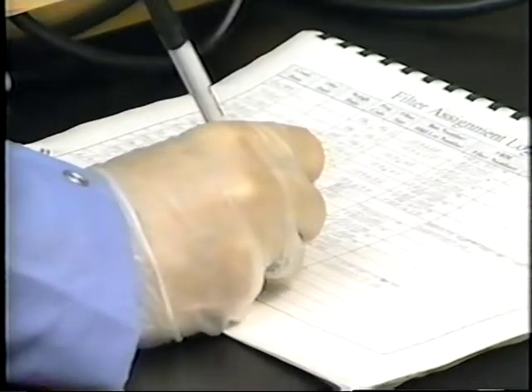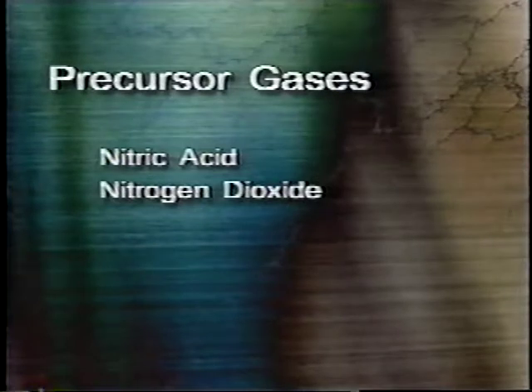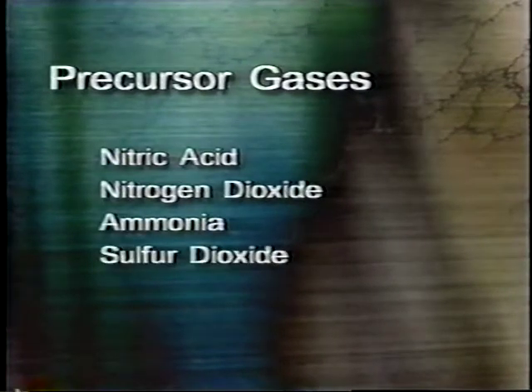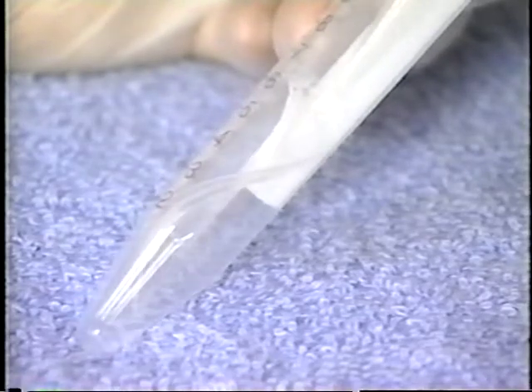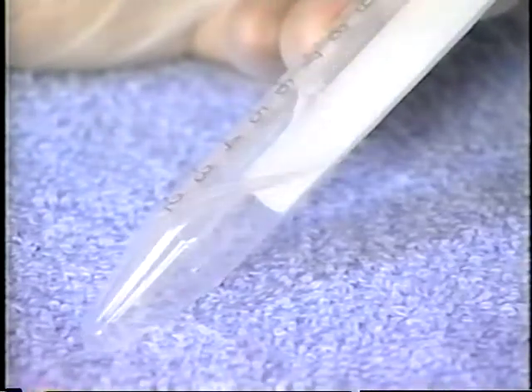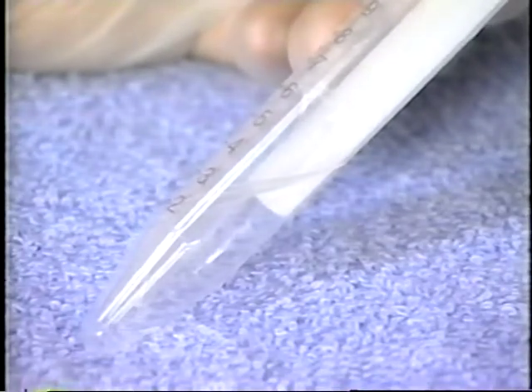and filter ID numbers. In areas with large secondary inorganic aerosol contributions to PM2.5, precursor gases such as nitric acid, nitrogen dioxide, ammonia, or sulfur dioxide should also be monitored. Cellulose fiber and quartz fiber filters can be soaked in solutions of gas-absorbing chemicals prior to sampling to collect these gases. Practical use solutions consist of the following. Note that in all cases, the balance of the solution is water.